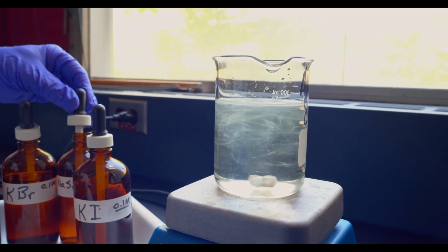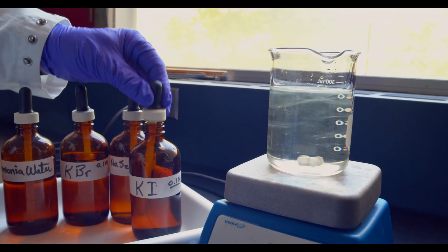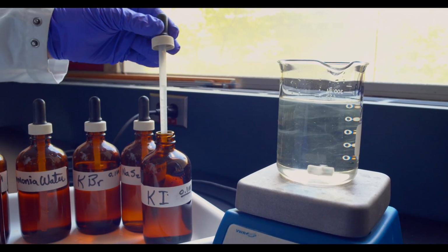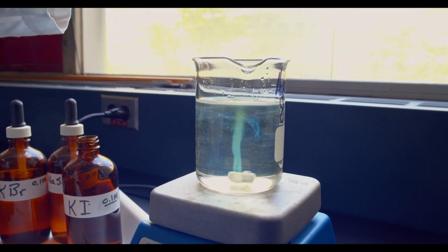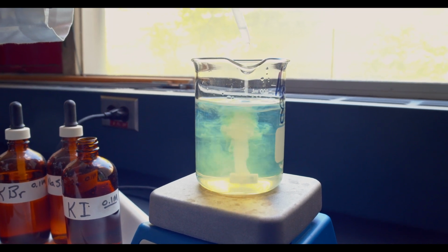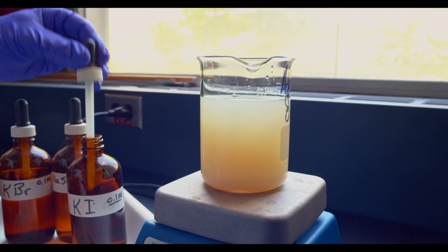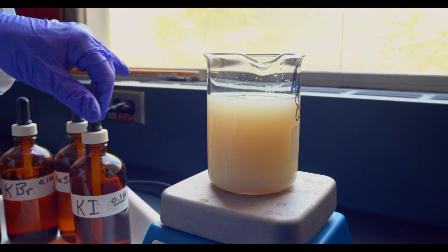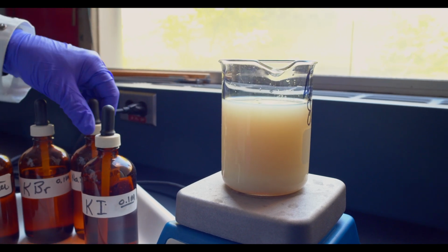So now we have a silver thiosulfate complex. And finally, the least soluble in this series is silver iodide. So I'm going to add potassium iodide. Now we have an insoluble suspension of silver iodide. And that is the end of this series.